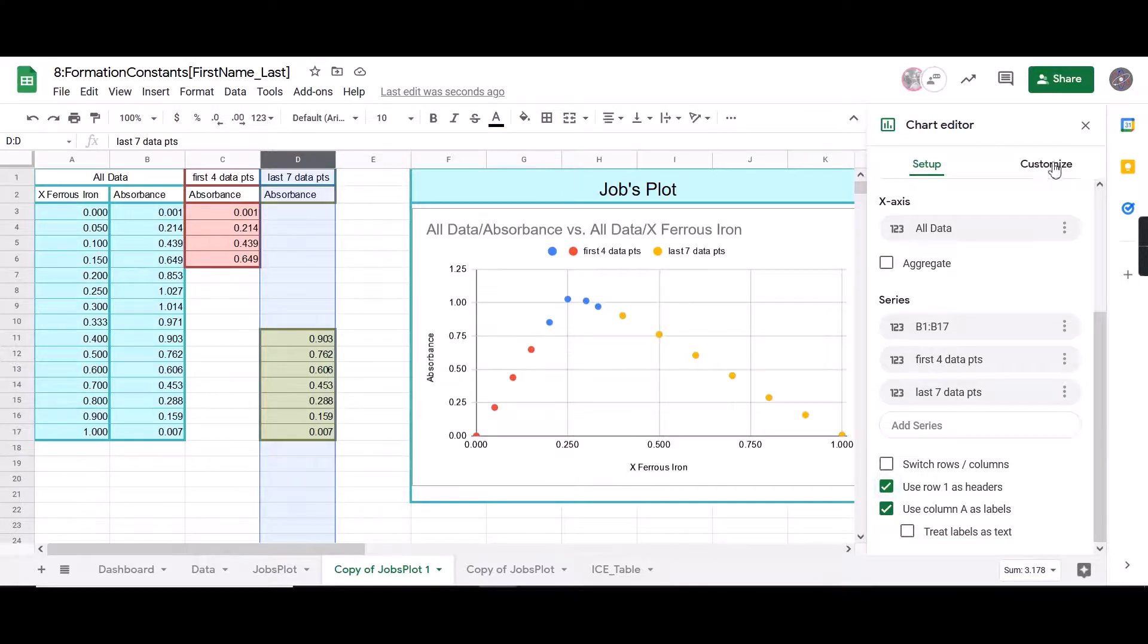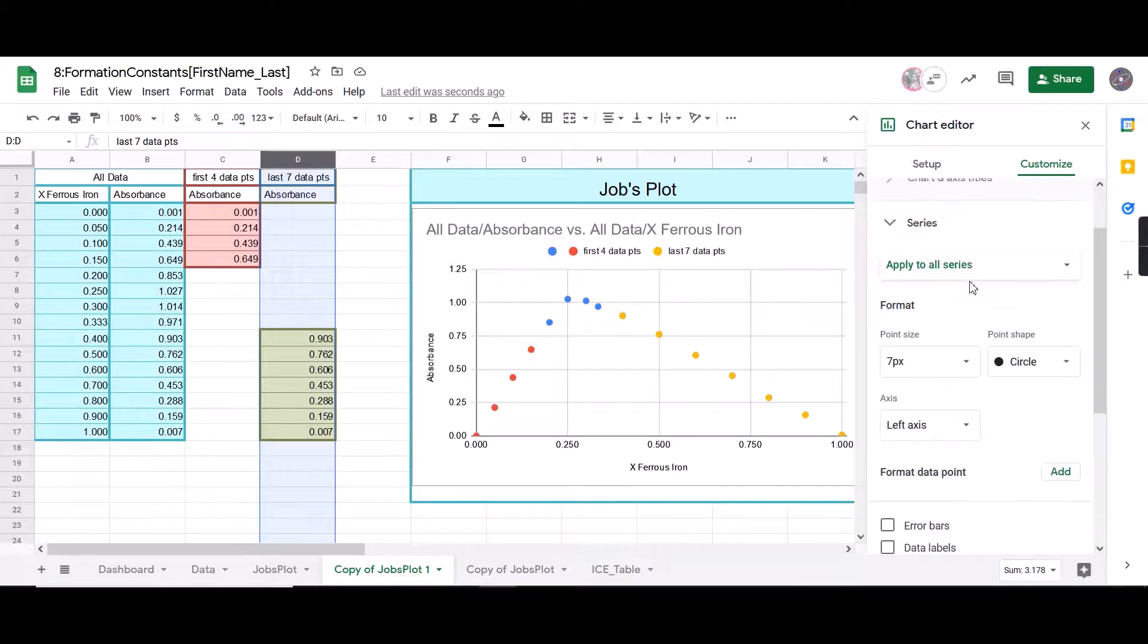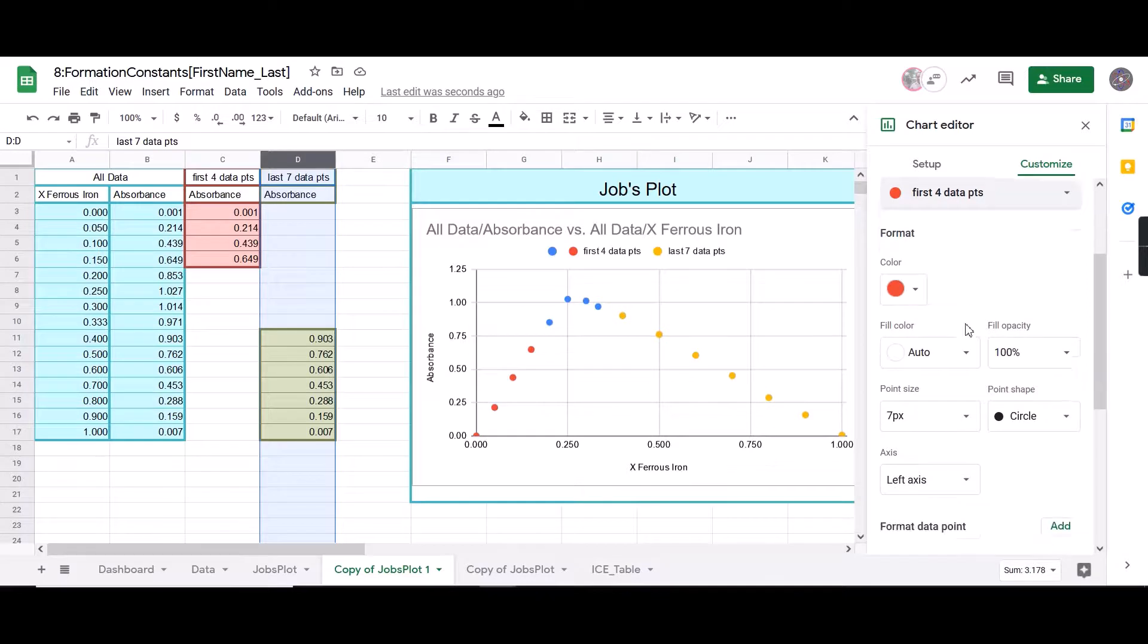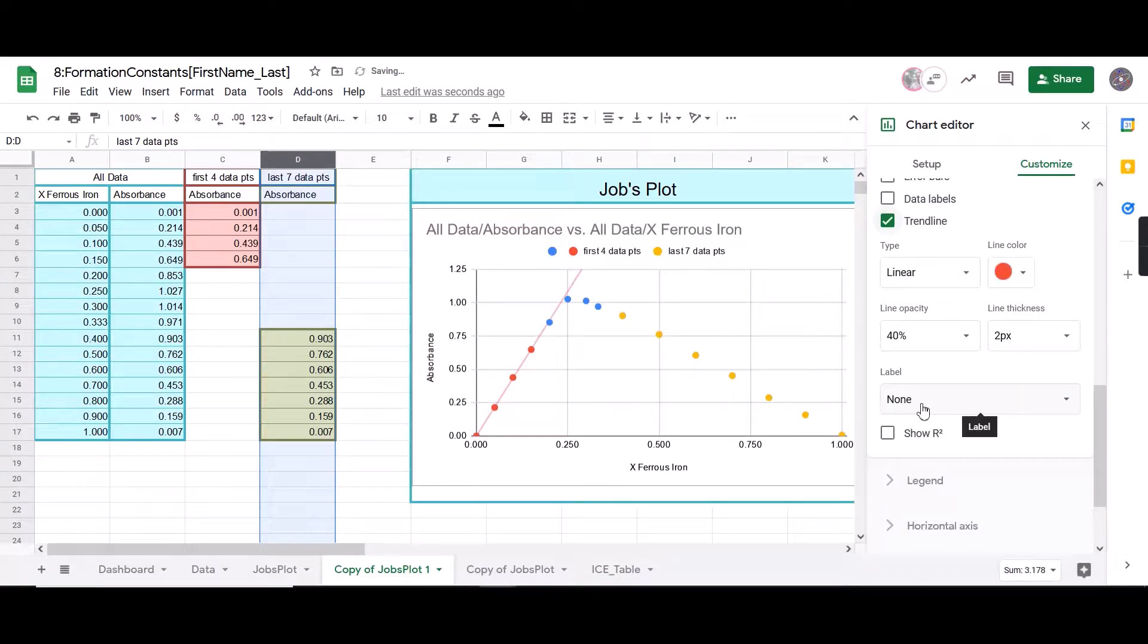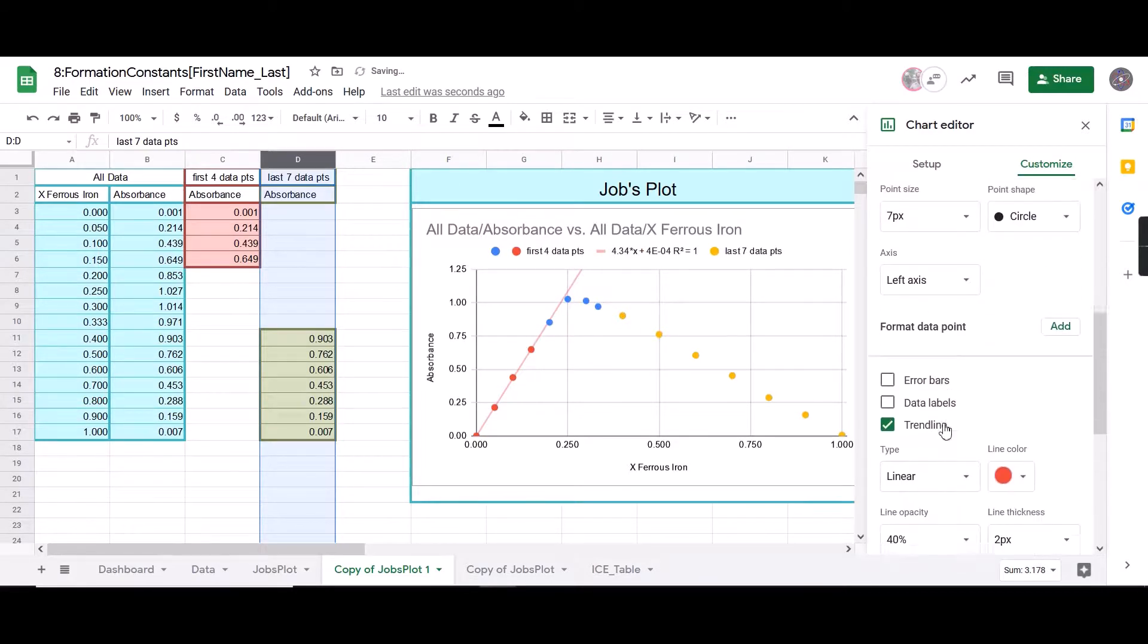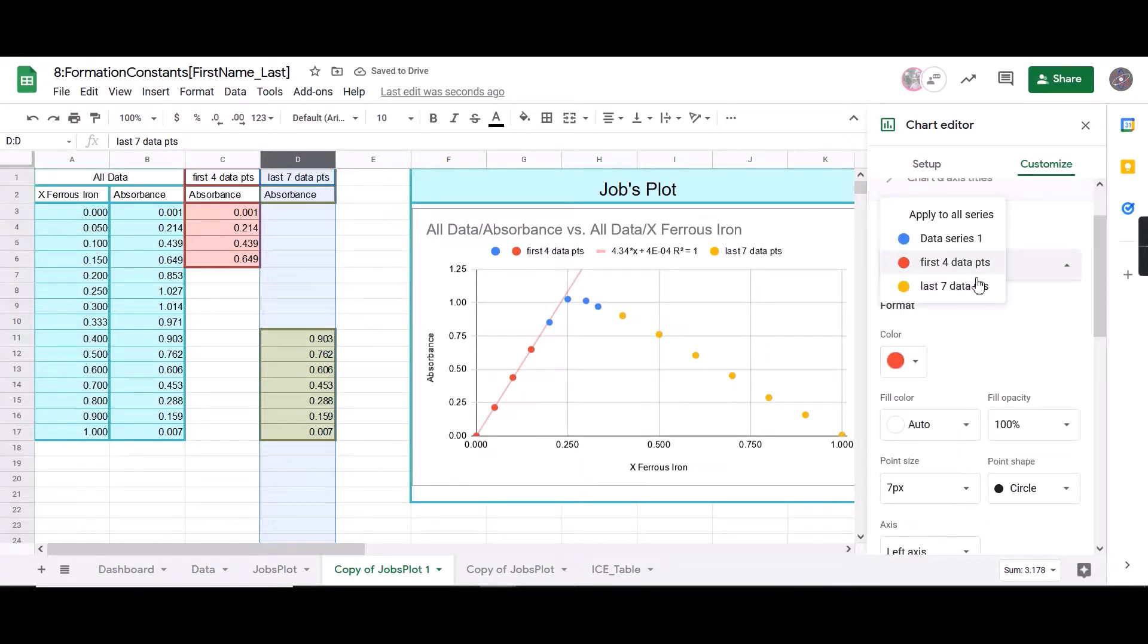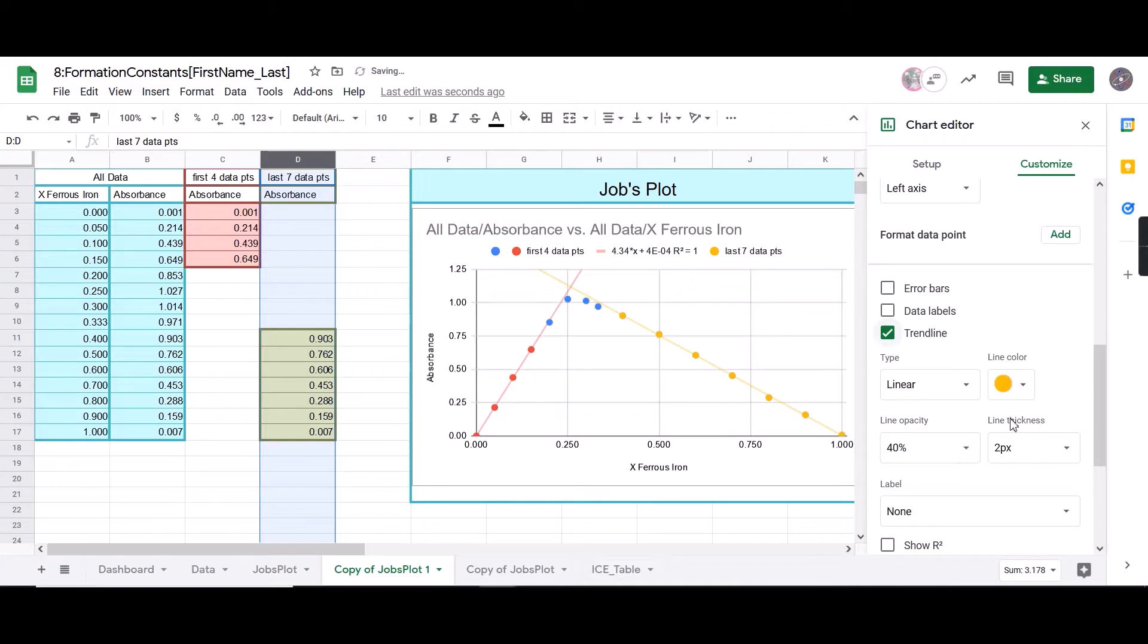Next, I'm going to come over here to customize, and I'm going to go to series. And I'm first going to select my red, so my first four data points. I'm going to click add a trend line. And for this one, I want to label it with the equation and show my R squared. Then I'm going to go back up and I'm going to select the last seven data points. I'm going to click a trend line, but I don't need the equation for this one. I only need the equation for my red.